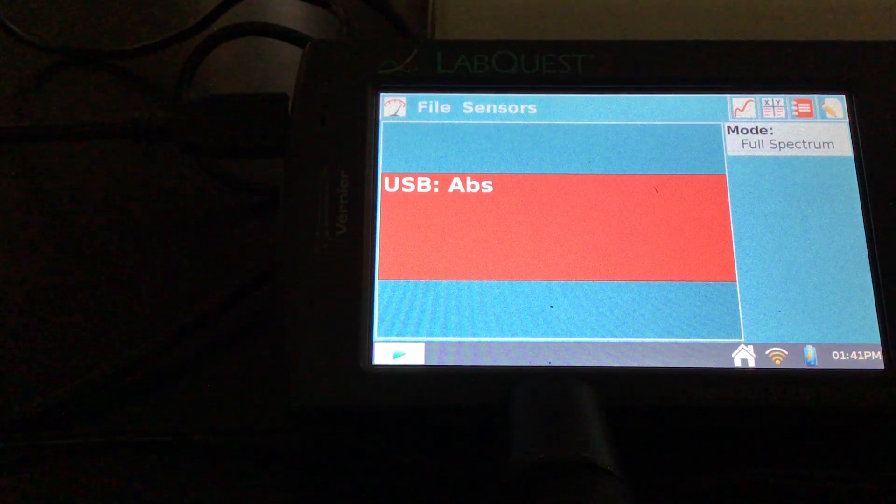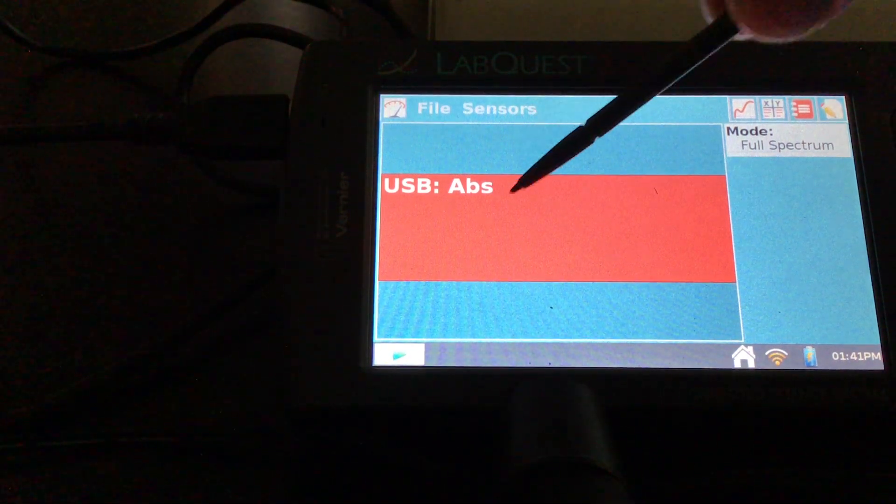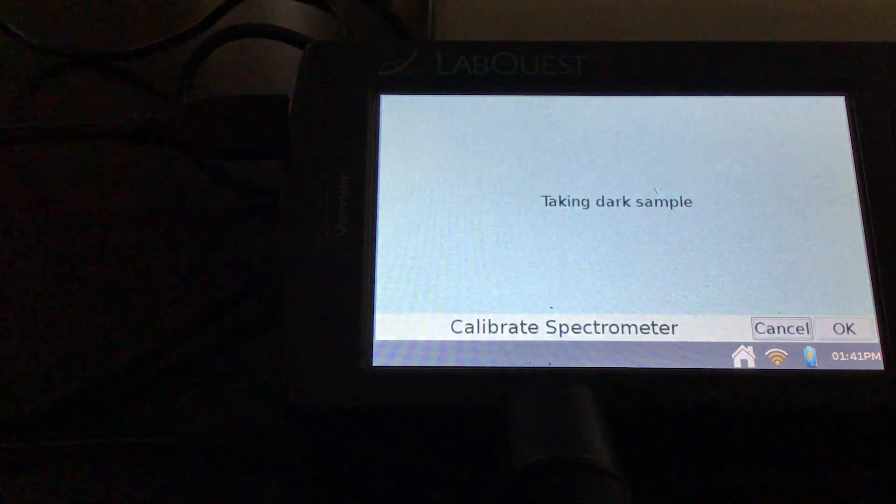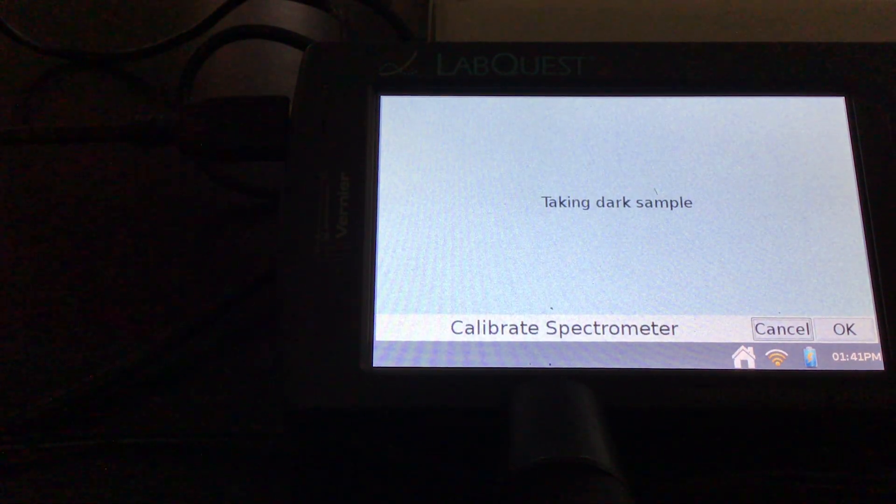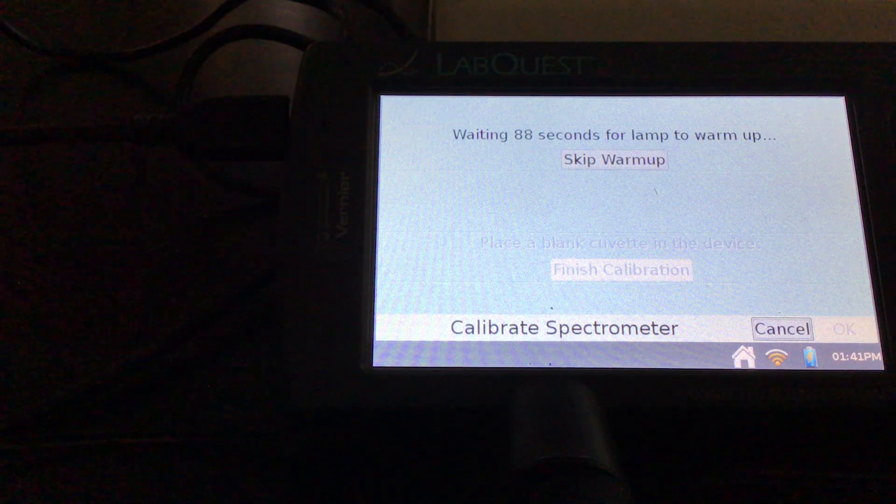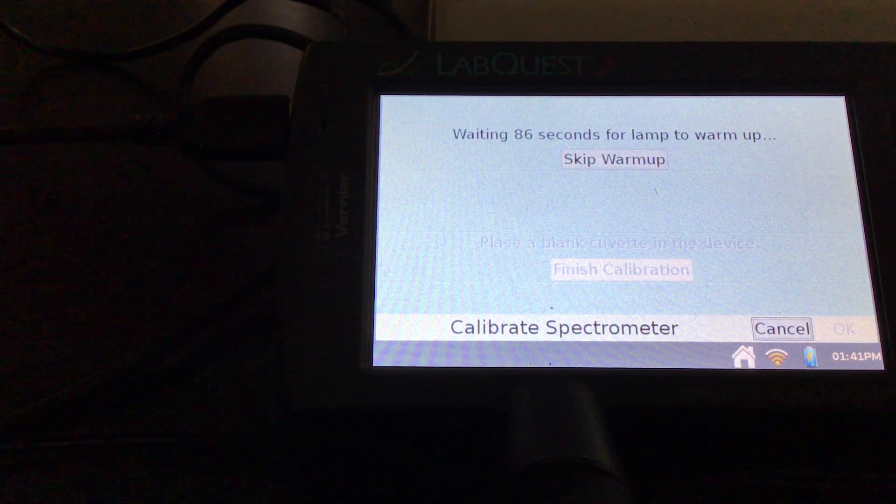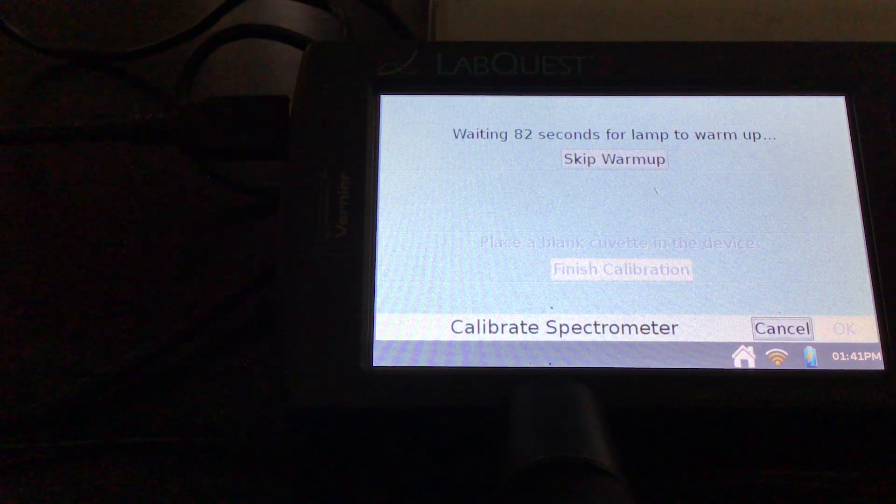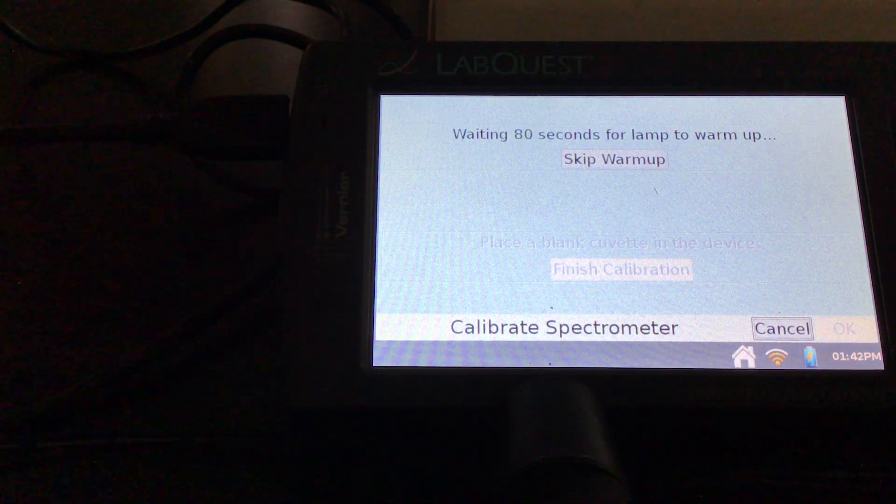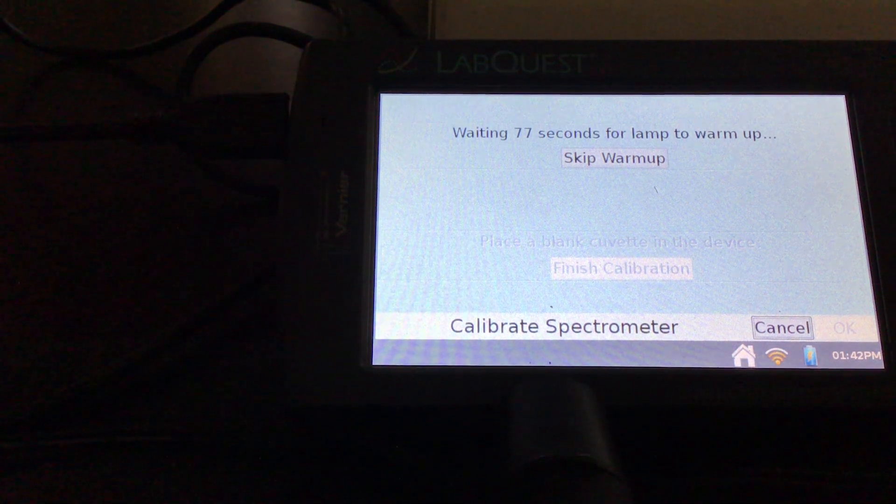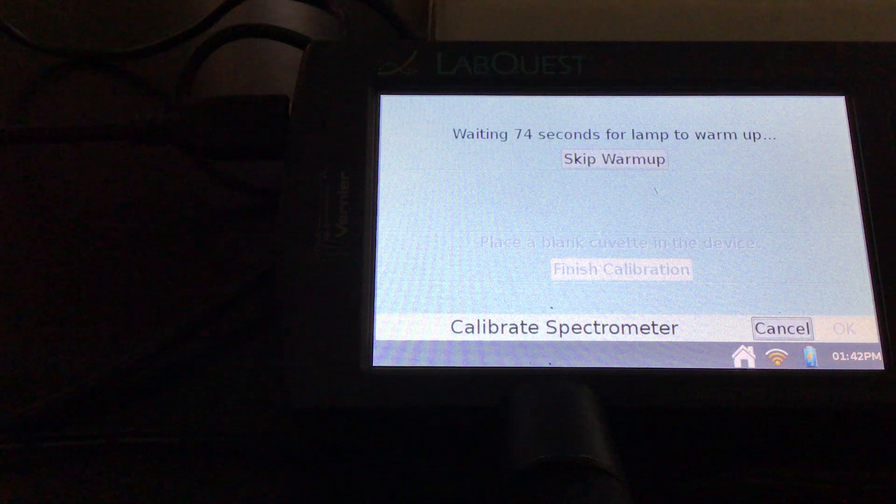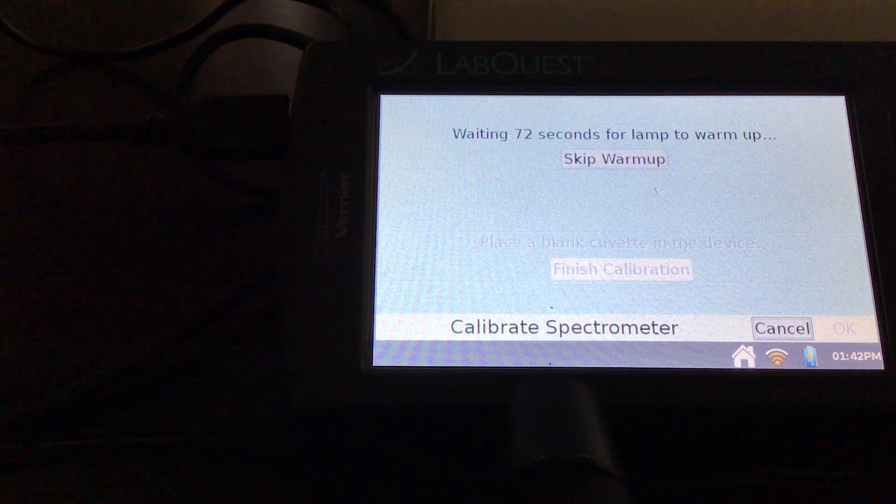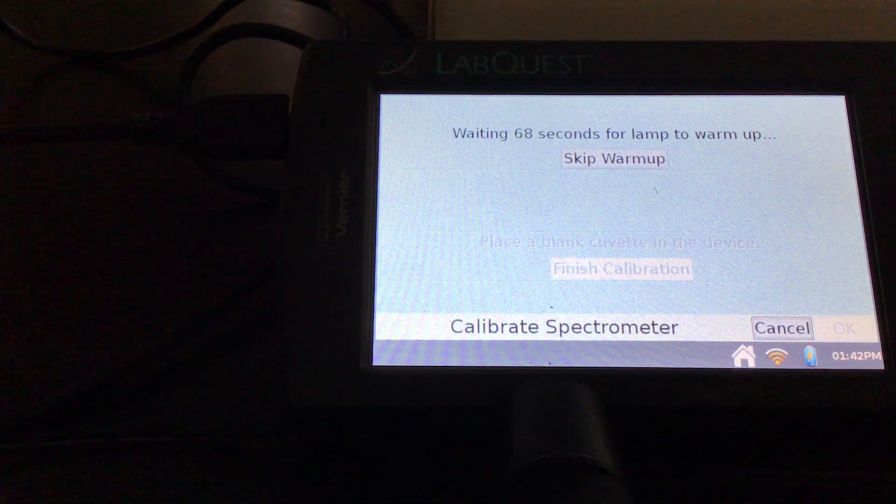So first thing we do is going to calibrate, and one thing that we're going to do today that's a little bit different when we calibrate is that we're going to be looking at a blank of the iron nitrate solution, your 0.2 molar iron nitrate solution. The reason we're using that is because iron nitrate could have some absorbance and we want to make sure that we discount that or get rid of it when we're doing our sample.